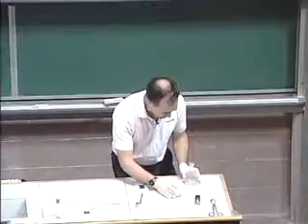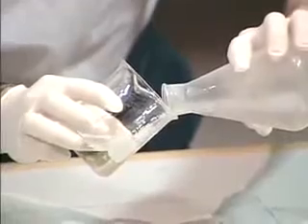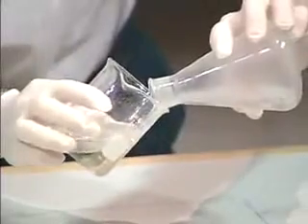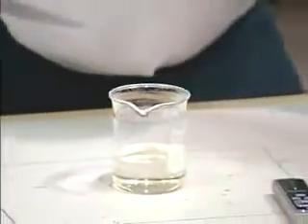Okay, so I'm very carefully going to pour this down the side. And then where the interface is, we'll have contact between the diacid and the diaminohexane. The hexane layer is floating on top here. But of course, where they come together is where the polymer can be made — where the condensation reaction is happening.